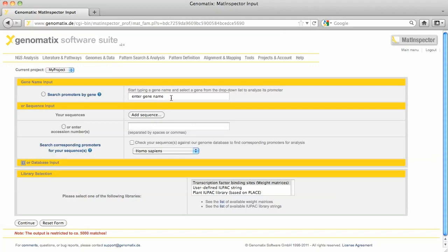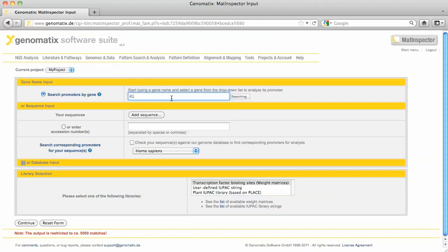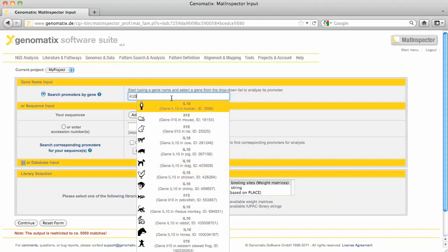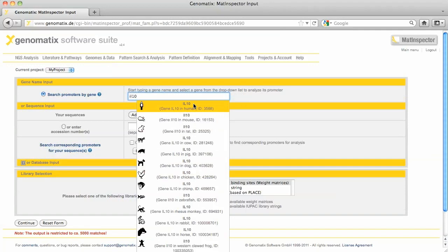For example, enter the gene symbol and let the system retrieve the promoters. In the gene search field, I enter IL-10 and a selection list is displayed from which I choose the human IL-10 gene and press continue.